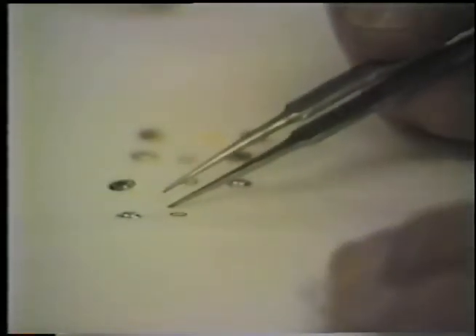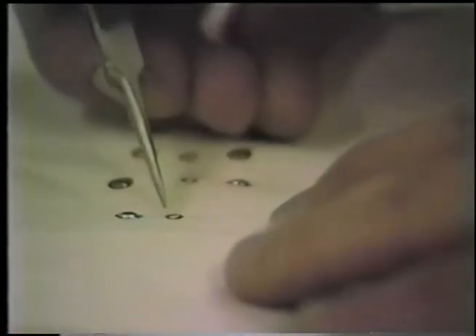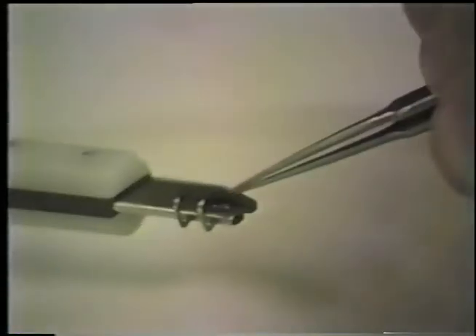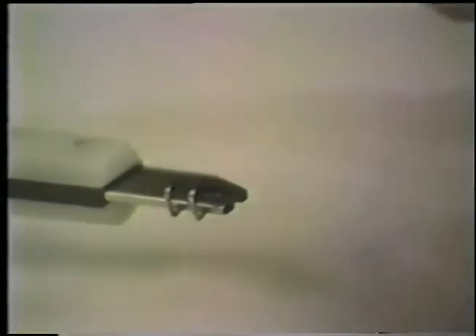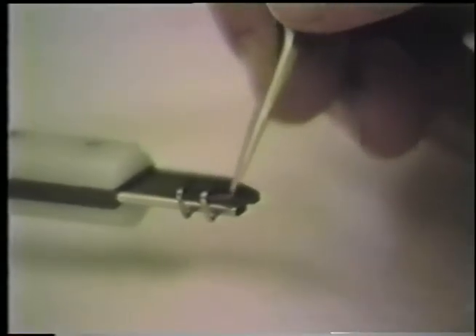The sample is now applied to the bottom specimen carrier, and we pick up the spacer and place it on the bottom specimen carrier and the sample and center it if necessary.